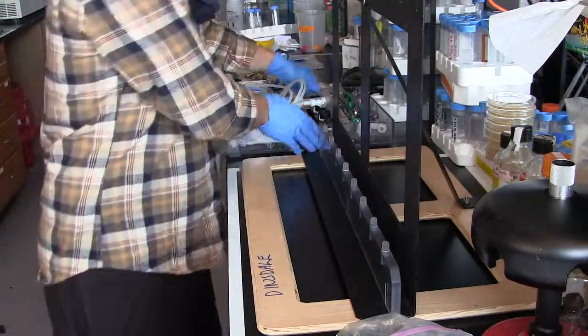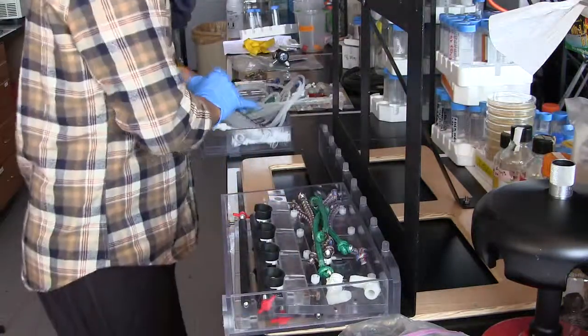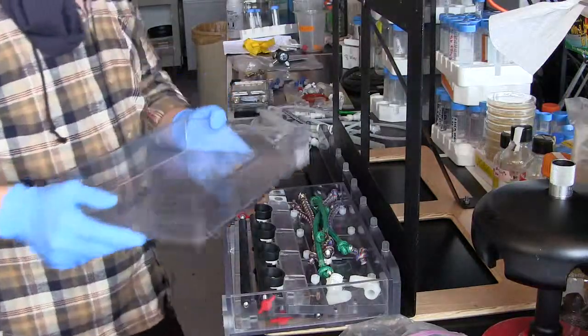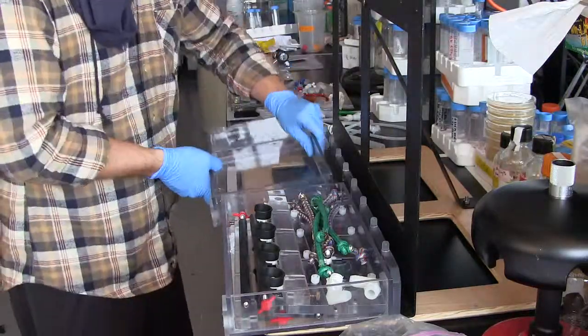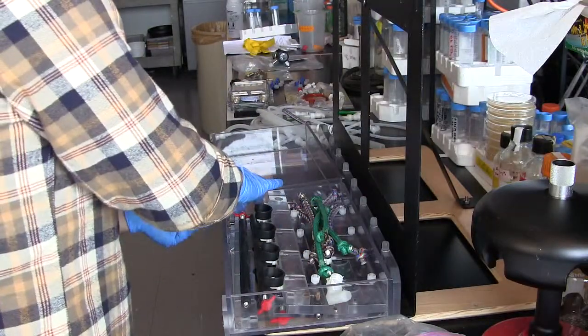The next thing we want to assemble is the stands where the sample gets held and water ends up. Okay. So you take one of the basins like this. There are two basins here, as you can see. You take the valves, you screw them in.